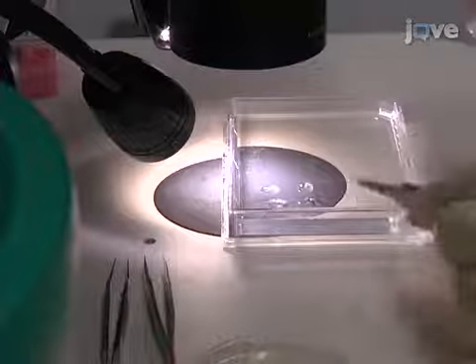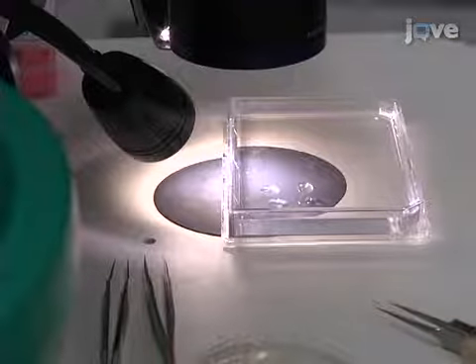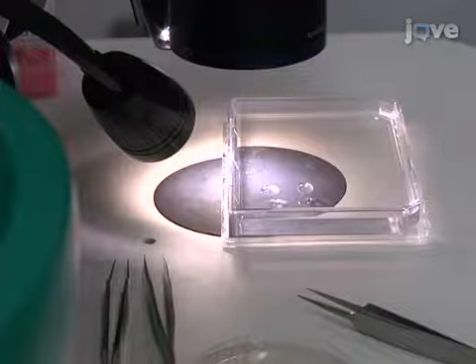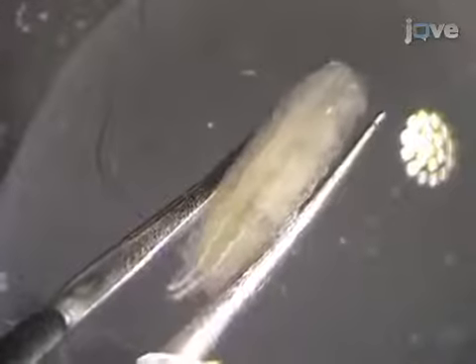Pick a wandering third instar larva from the vial wall and place it in a 50 microliter drop of ice-cold PBS on a dissection plate made of Silgard elastomer in a tissue culture dish.